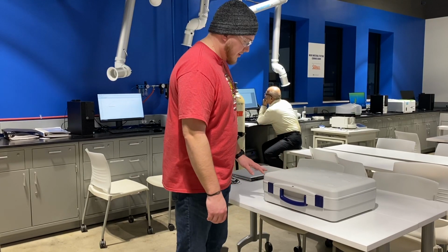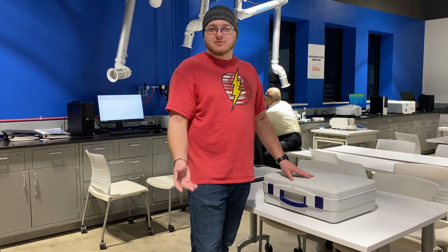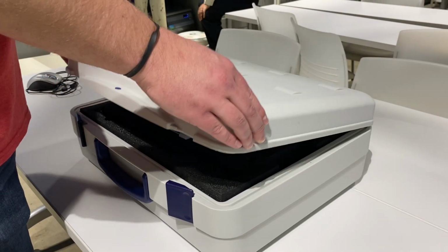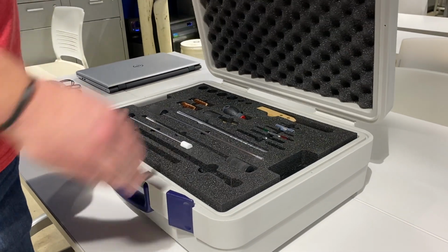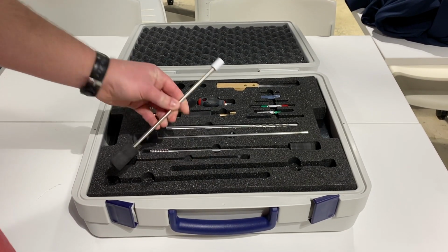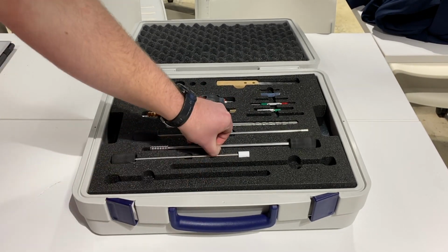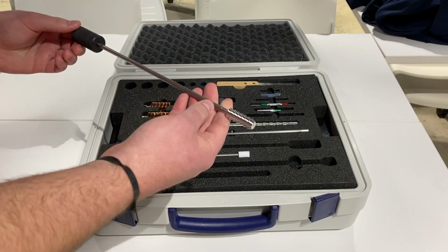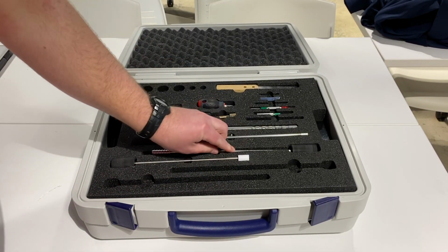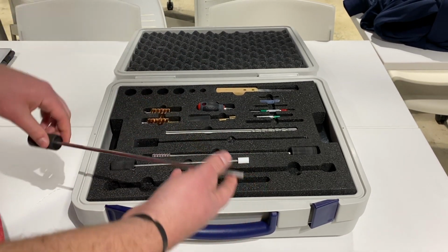All right, so in this special looking briefcase, we have our tools that we'll use for the capillary rheometer. Let's take a look inside. So here we have our little toolkit. Right here we'll use this to load our material into the barrel. Here's our cleaning rod. If you remember from the melt flow indexer, it's pretty similar, it's just bigger. This is our loading rod. We use this to put the die into the barrel.